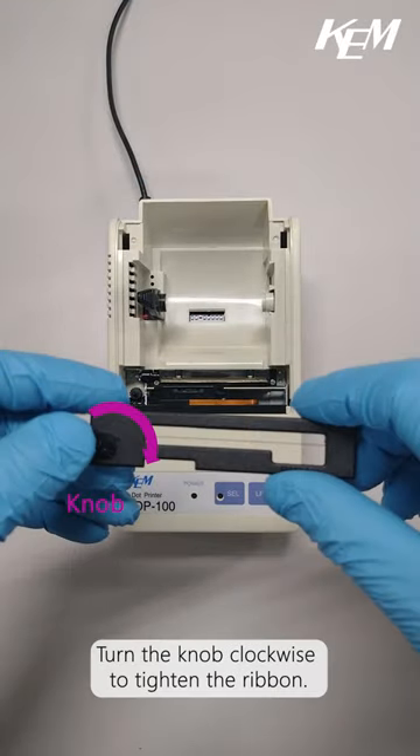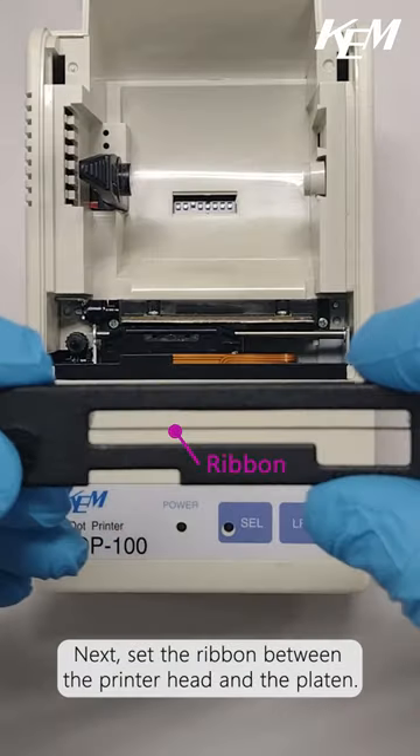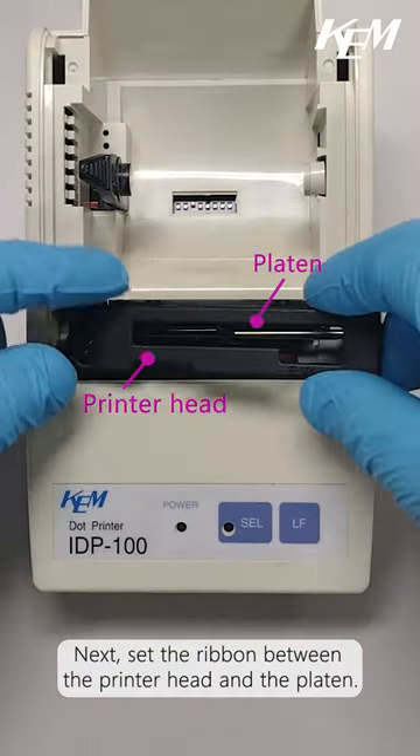Turn the knob clockwise to tighten the ribbon. Next, set the ribbon between the printer head and the platen.